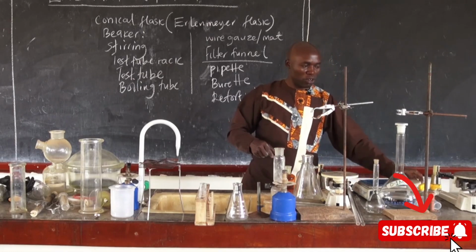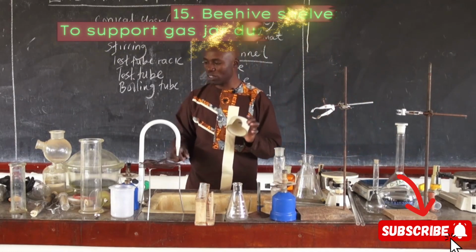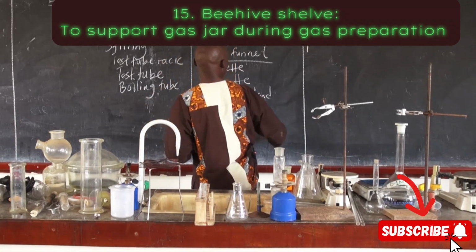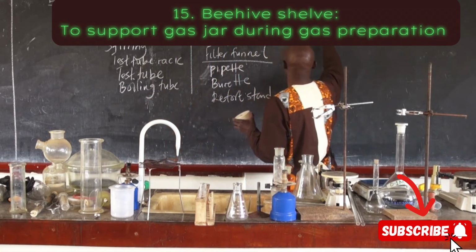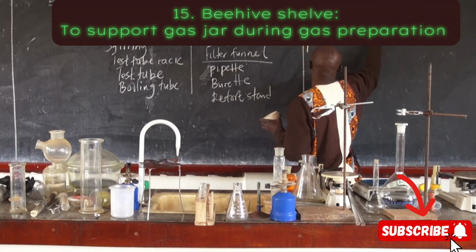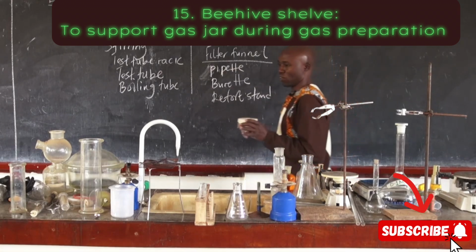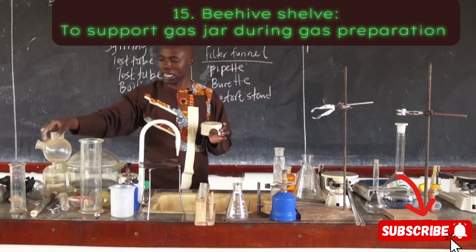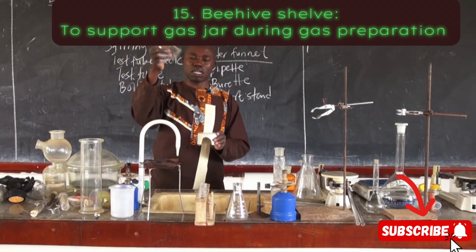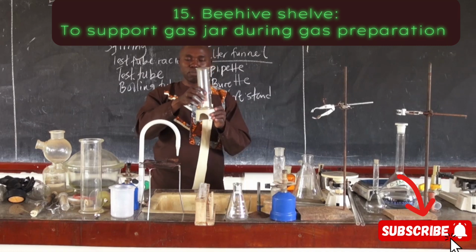Let me talk about this apparatus, which is called a beehive shelf. That's called the beehive shelf. It's normally used to support the gas jar during gas preparation. So this is normally put on the beehive shelf.